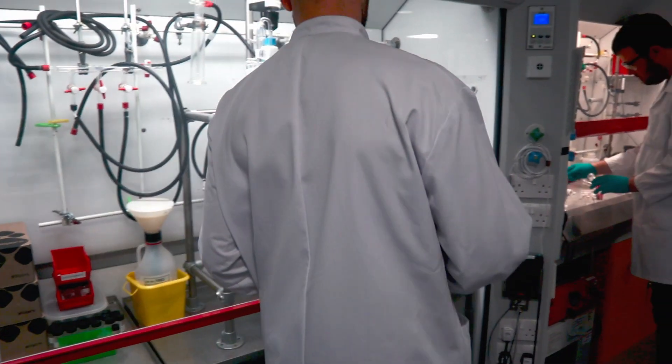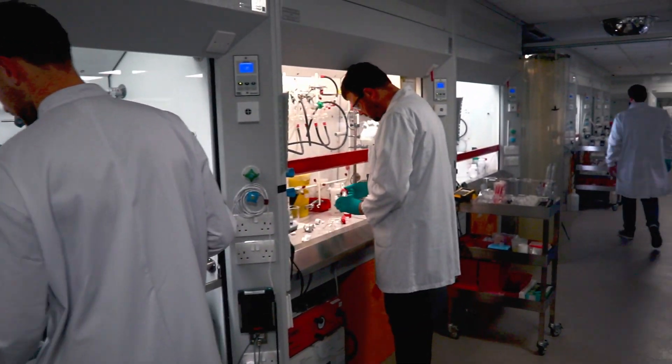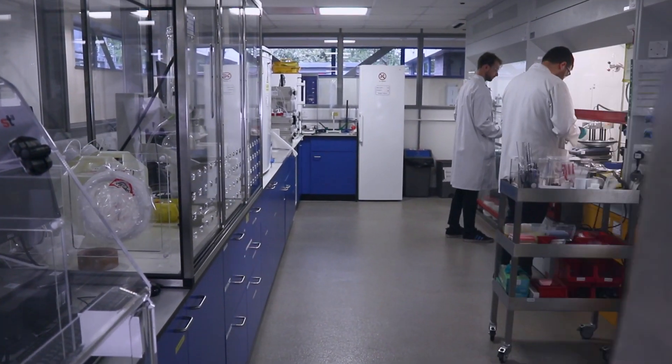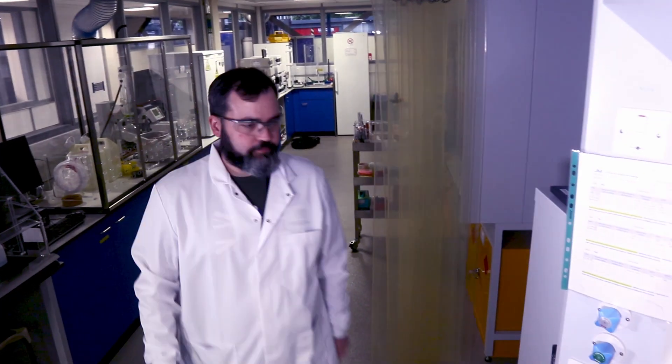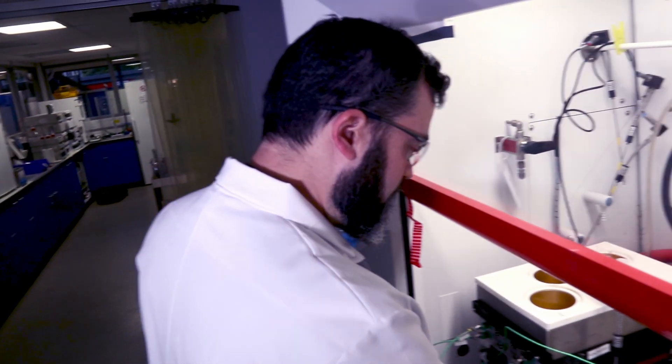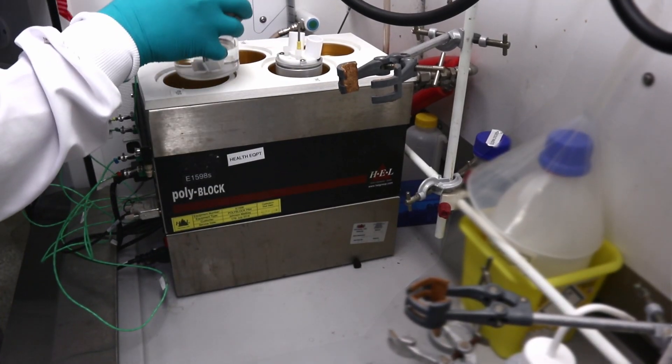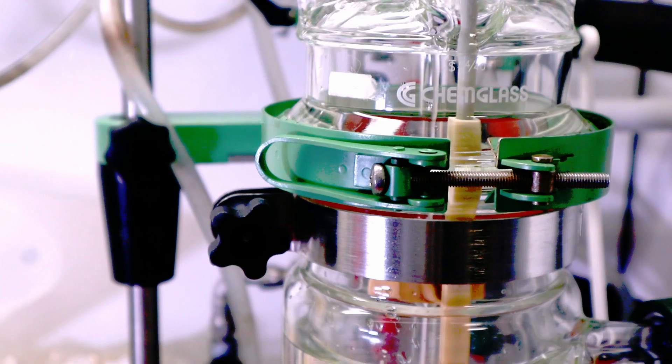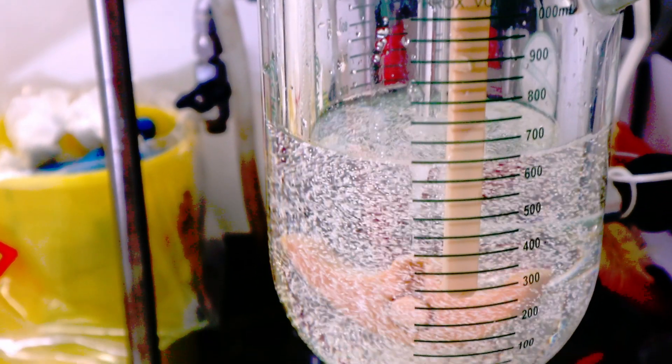Our Cambridge site is one of three sites where we perform early phase chemical development and subsequent manufacture to support client drug development programs. We also have sites in Devons and West Deptford in the US where we offer subsequent manufacture and GMP manufacture to support client programs.